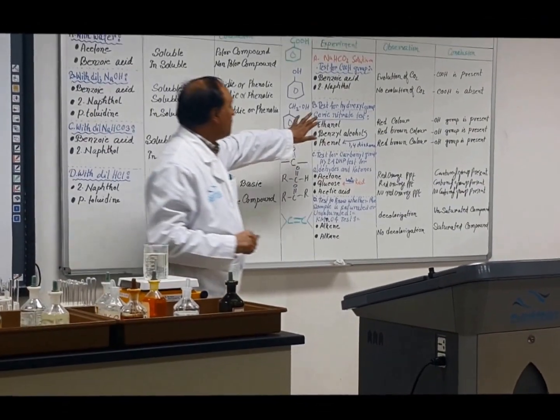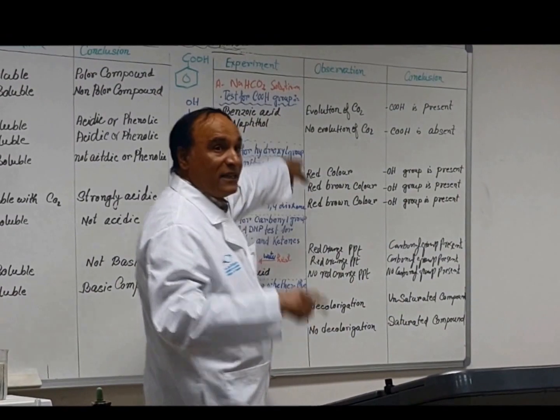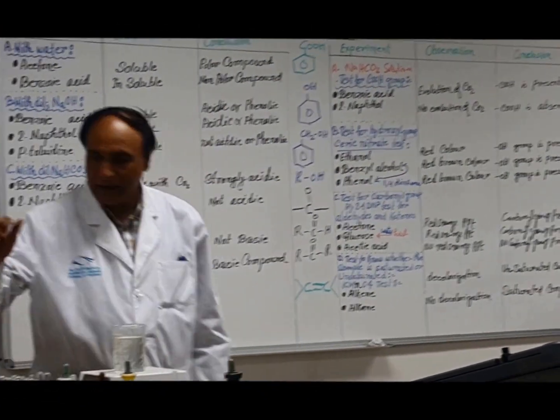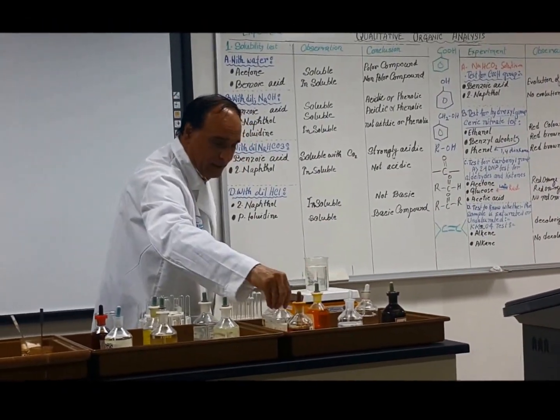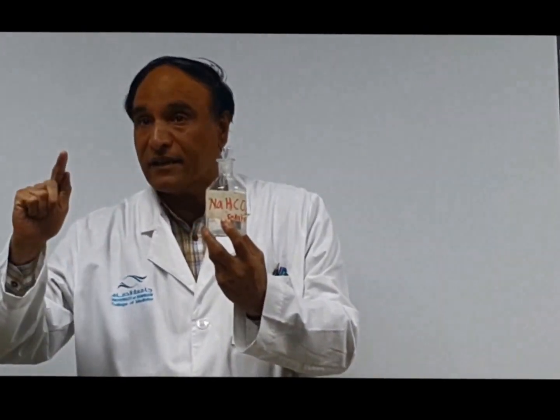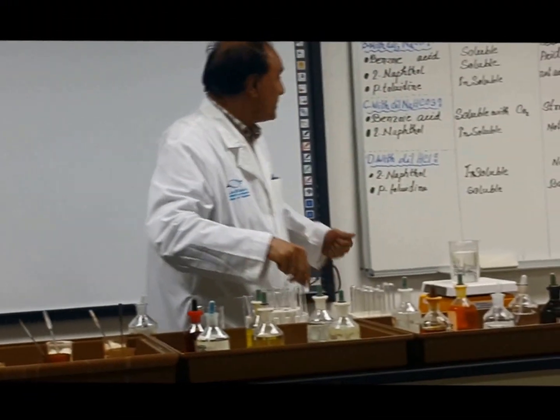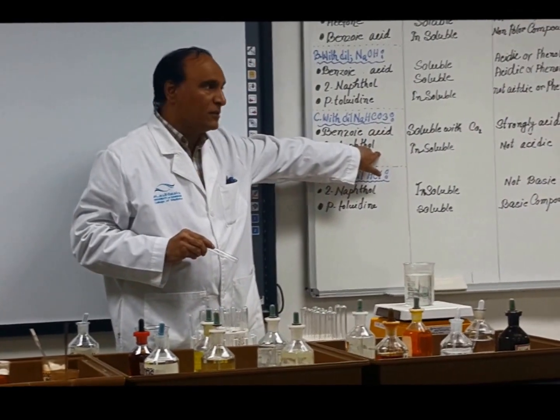The first functional group I am talking about is carboxylic acid. I just told you the best test of an acid is sodium hydrogen carbonate. I told you that sodium hydrogen carbonate is the best test of an acid, not only organic, all the inorganic also. This is the same test which is over here. Once again I am doing it with you.